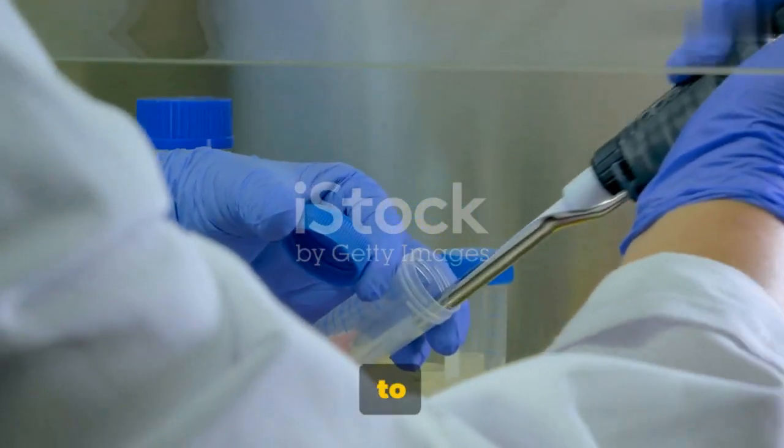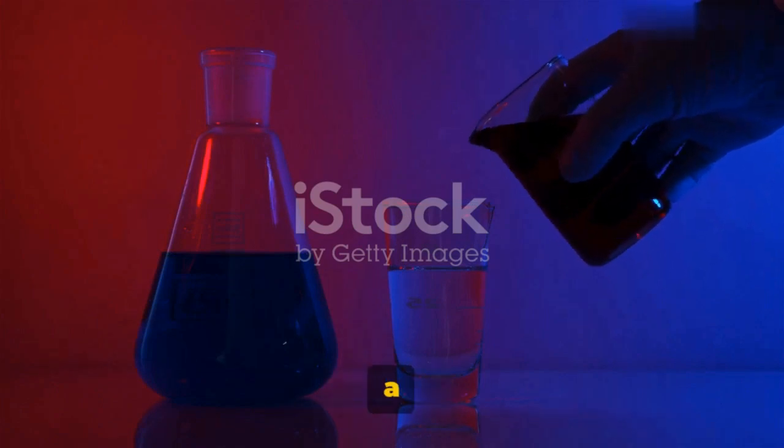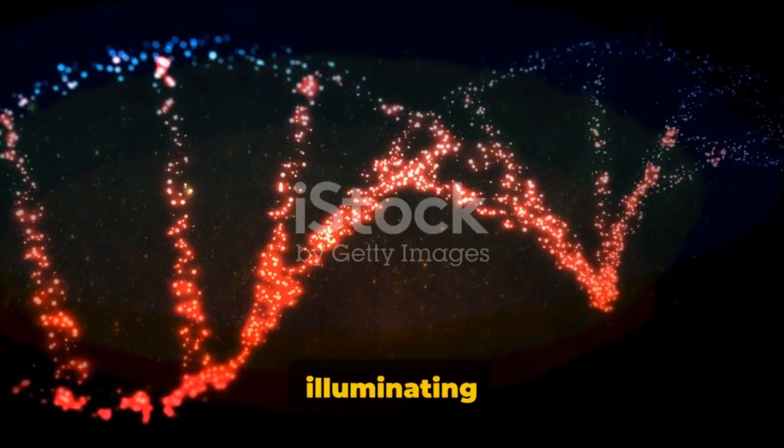Now, let's turn our attention to SYBR Green. This intriguing fluorescence marker is a dye that emits a strong fluorescent signal when it binds non-specifically at the minor groove of DNA. It's like a beacon of light in the dark, illuminating the DNA sequences it binds to.